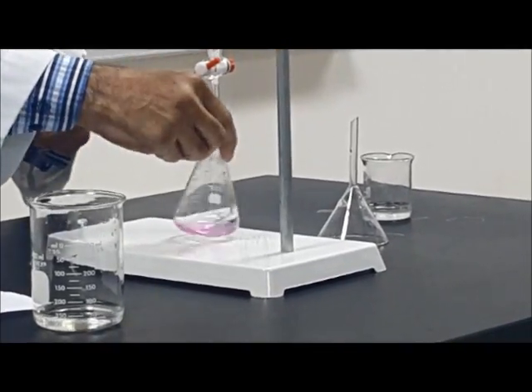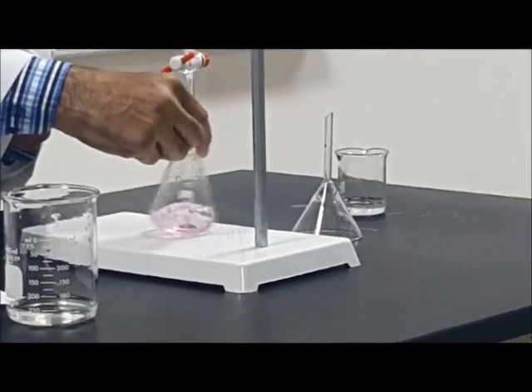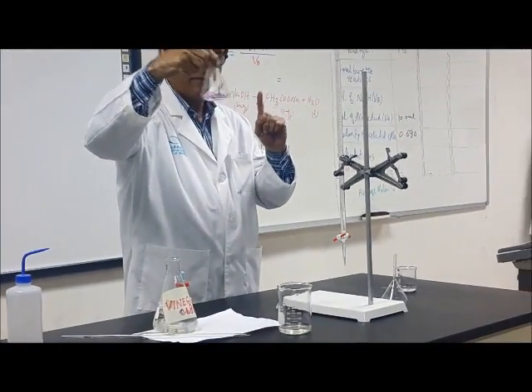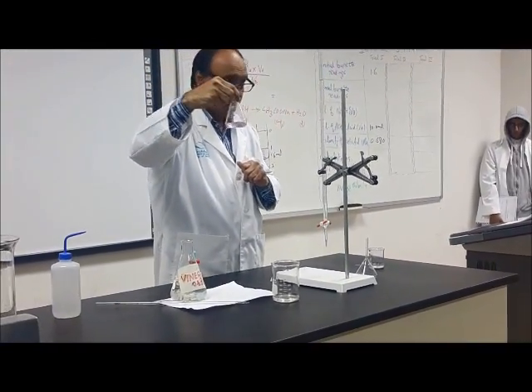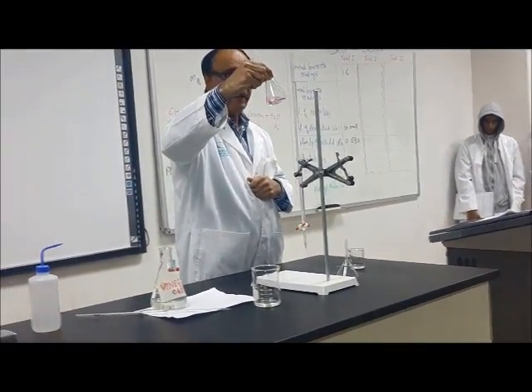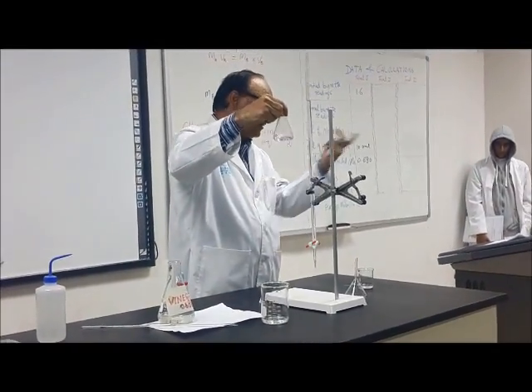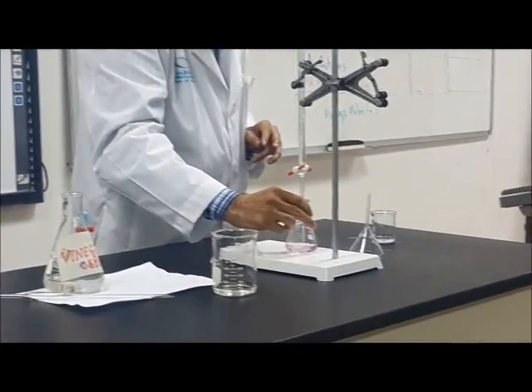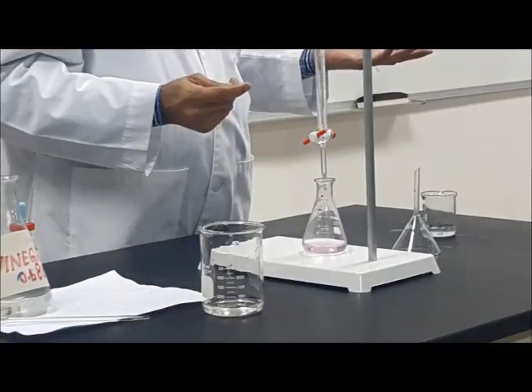So this is the end point. You see it came with 1 drop. Did you see that one? Yeah. All is pink. Now it is not going. Wait a minute. And if you find this is the best color, but if you find it is very, very light, you can put 1 drop more.